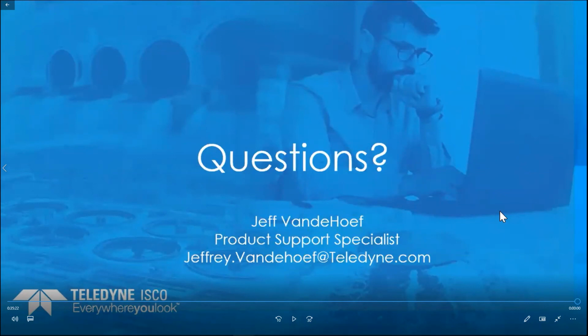Thank you, gentlemen. We received another question through the chat function, and it is, can you trigger off of turbidity? Yes. Basically any parameter that we're measuring and storing with the sampler from a sonde or other interface device, as long as we are recording that as a data parameter, we can trigger off of that. So yes, we can trigger off of turbidity, pH, anything the sondes are reading, no problem.